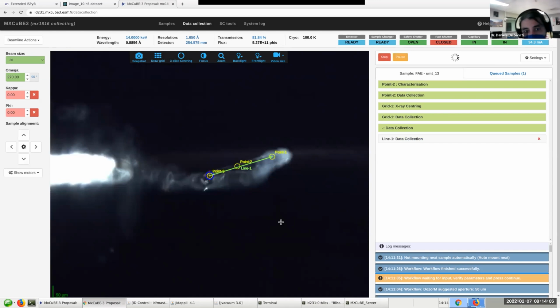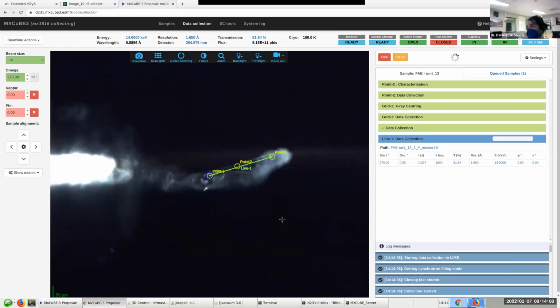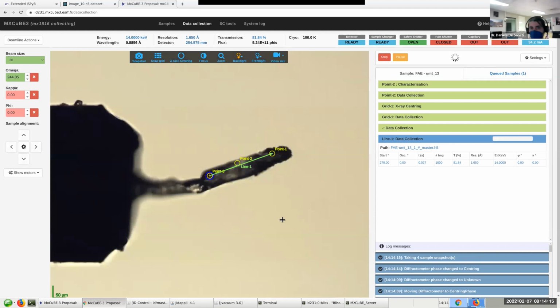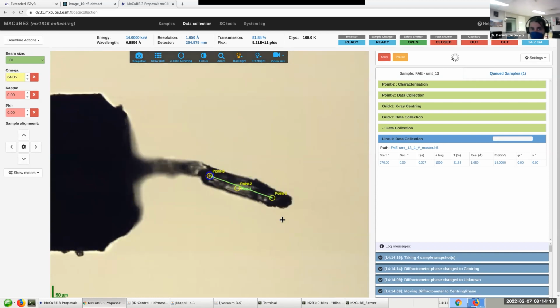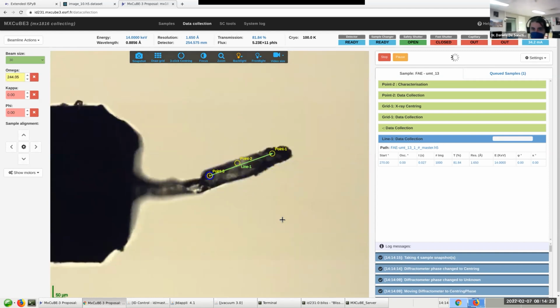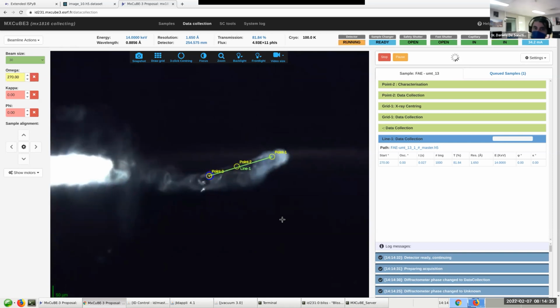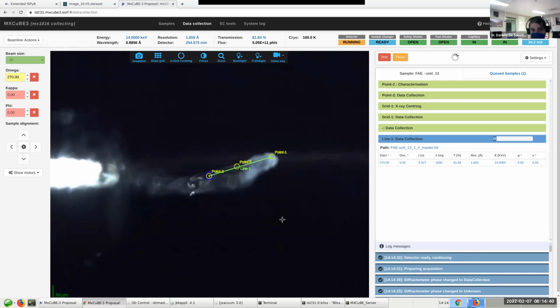So we see that while it collects and when it goes. Then next I'm going to show you something that we call the 2D points, which could be a useful tool that has been there for quite some time, but we didn't advertise it too much. But it could be useful whether you are trying to see where the crystal is, or to see if a crystal is well centered, or if what you're looking at is a crystal, without having the need to do a mesh scan.